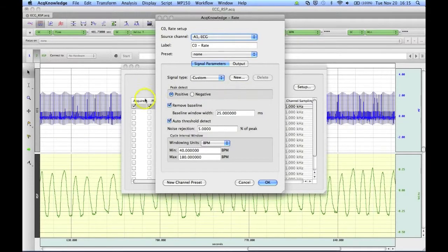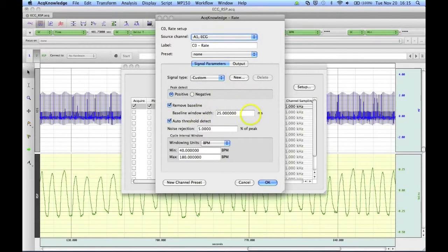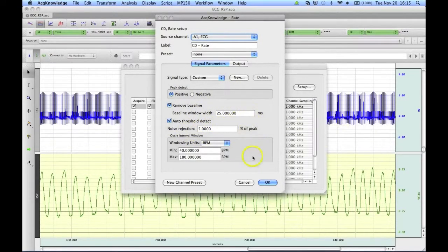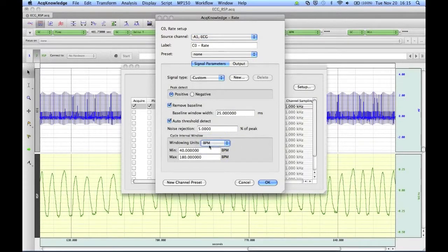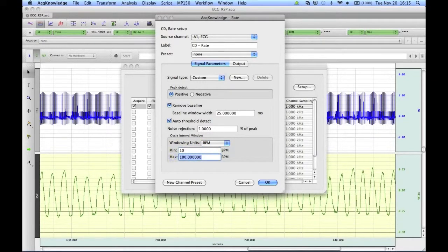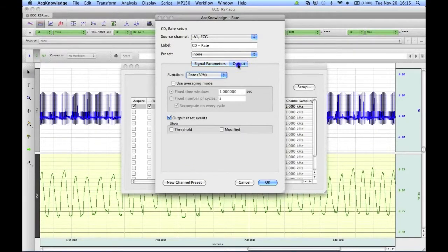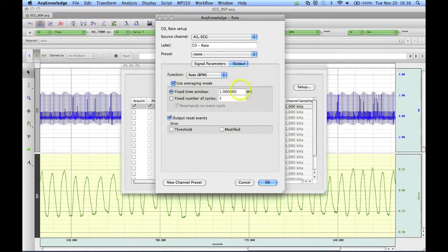We can then enter in any custom settings such as a positive or negative peak detect, our baseline window width, the noise rejection percentage, and our windowing units in hertz, beats per minute, or seconds. We could change this to 10 and 300. We could then also change the output options to use averaging mode, for example, and have an average every 10 seconds.